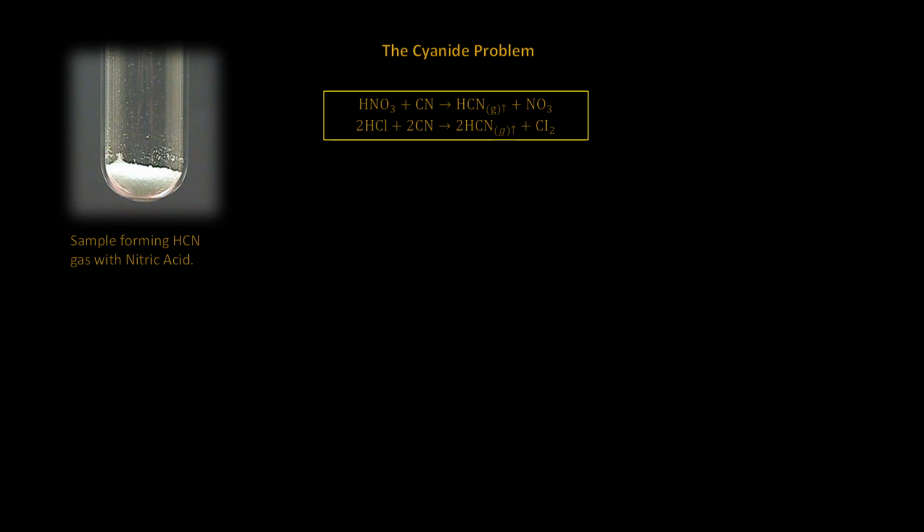However, as small-scale miners and prospectors, as well as some of you hobbyists out there, we tend to take samples from mine tailings every once in a while. Now, these samples may contain cyanide as a residue. The cyanide must be destroyed. This can be accomplished with ease, but must be done with safety in mind. Cyanide gas can be deadly.